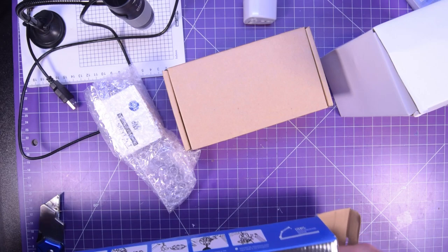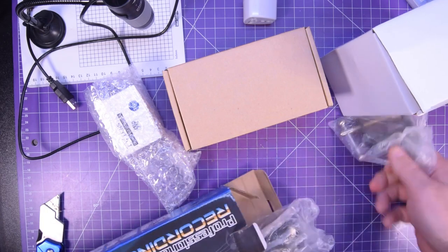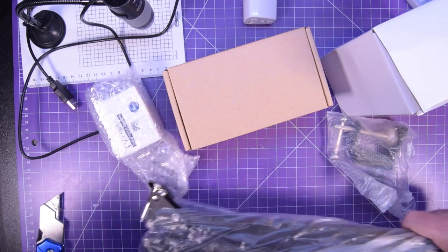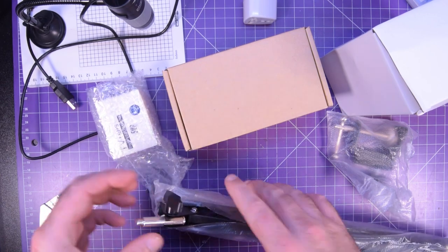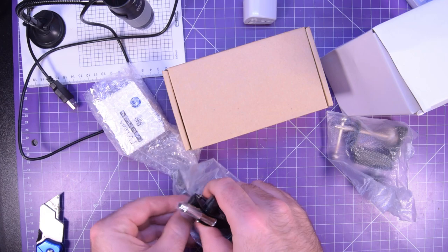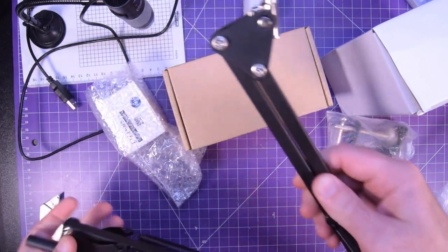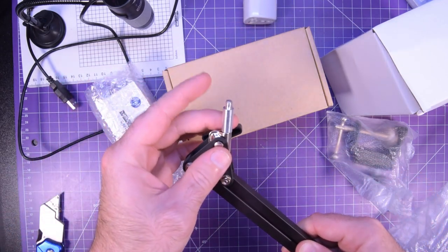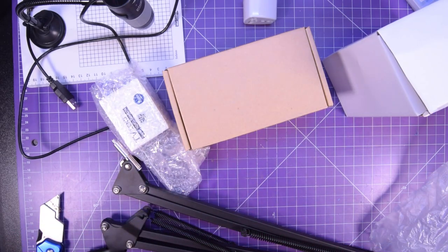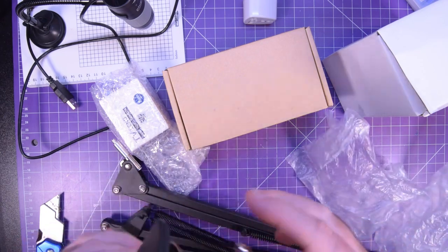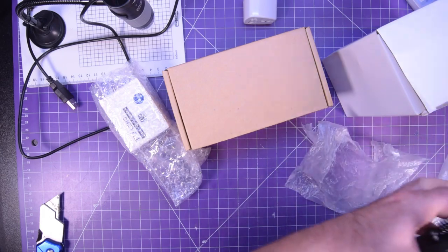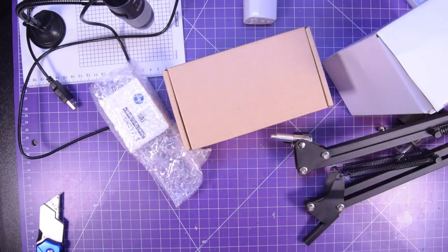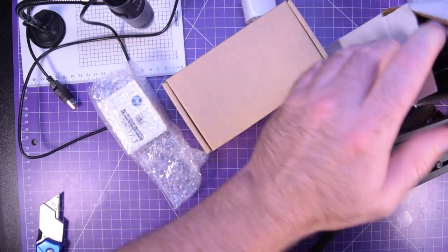This here should be a stand. These stands are like a dime a dozen. But if you look at the price of this camera with and without the stand, the package with the stand is like the same price. Especially when I picked it because it was on sale. So yeah, it's just a regular stand here. Looks like it's a 1/4-20 thread at the end. And there's a little clamp that goes on your bench. This thing weighs a ton.